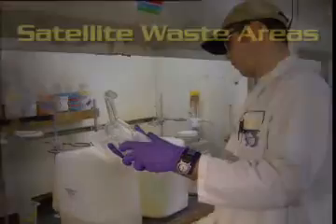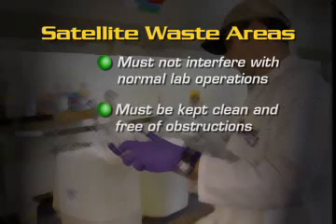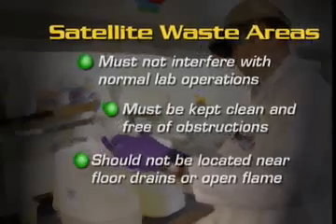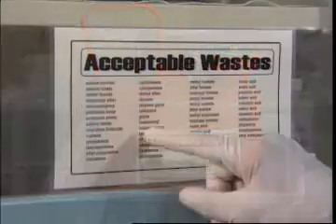Satellite areas must not interfere with normal lab operations and must be kept clean and free of obstructions. Avoid locating satellite areas near floor drains or any sources of ignition. Flammable wastes must always be accumulated in a safety can or other approved container.